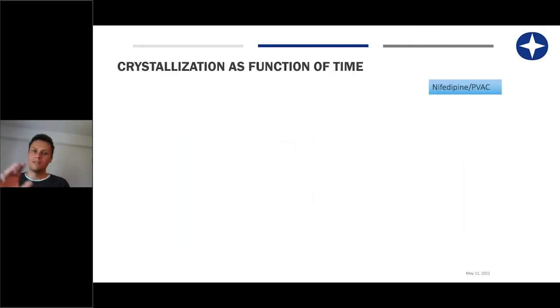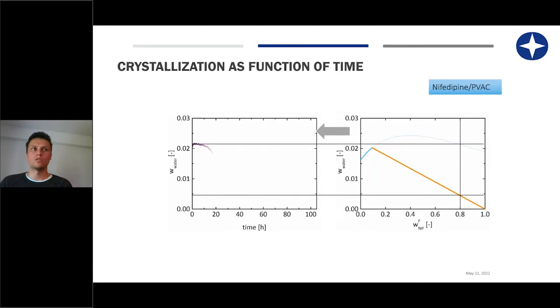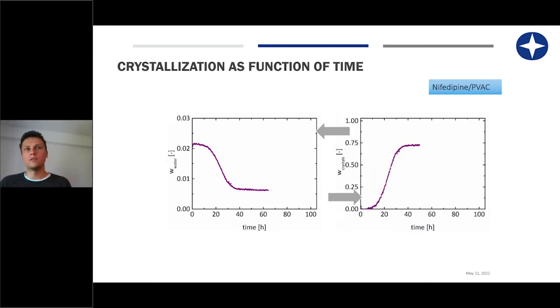And this is something we then determine, as shown here for the formulations: we determine the crystallization as a function of time and assess how fast each formulation crystallizes. So we see the water sorption measured goes up and then down, we convert that, see that it fits, and then we convert it to the crystallinity and see the crystallinity quantitatively in situ during time.